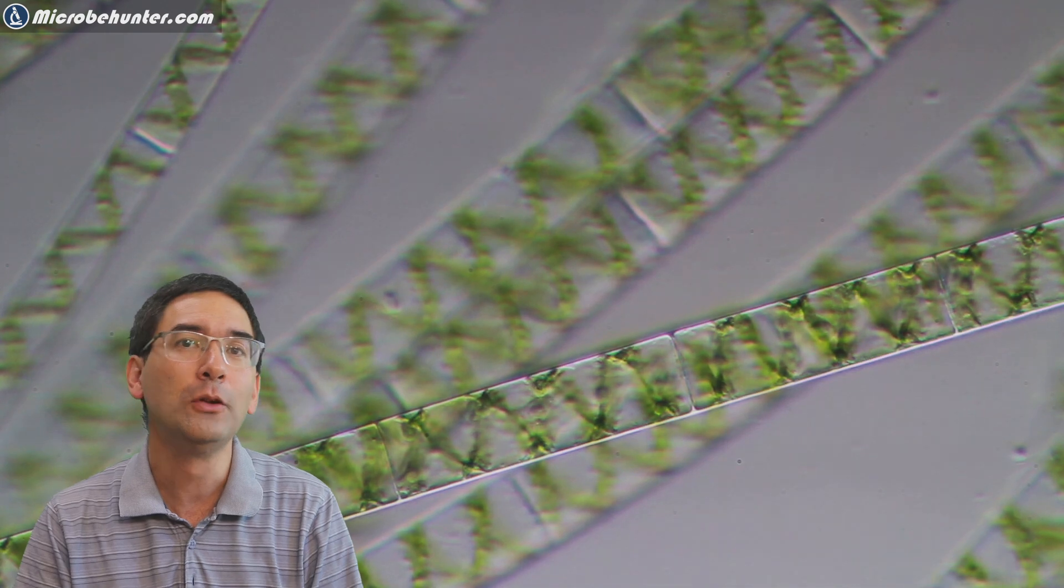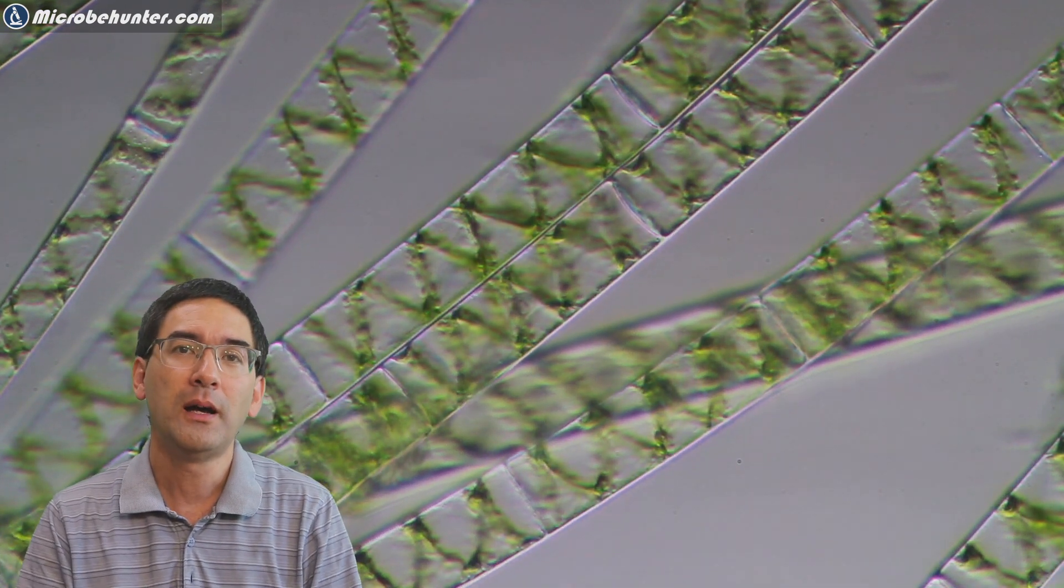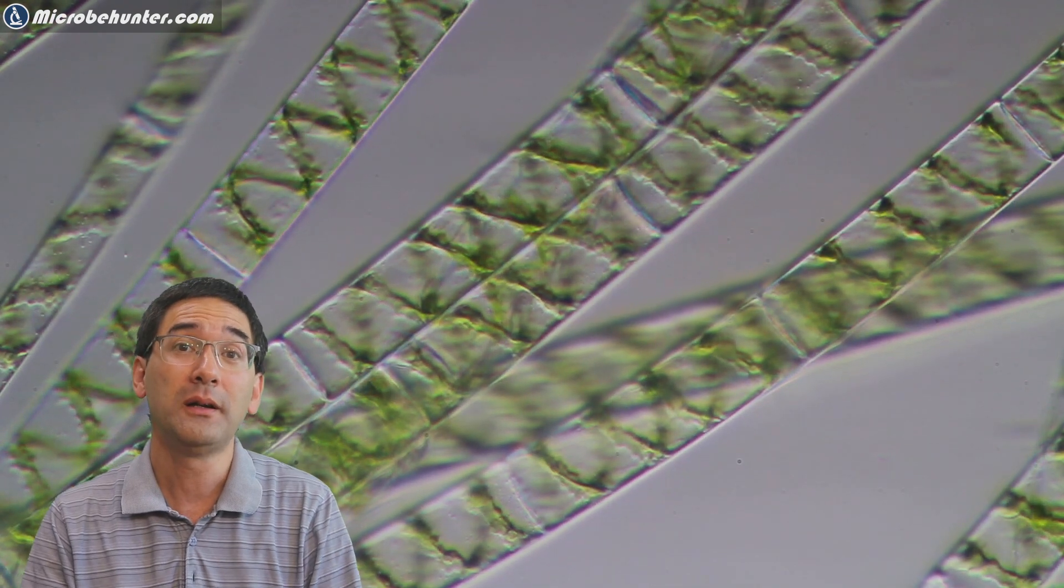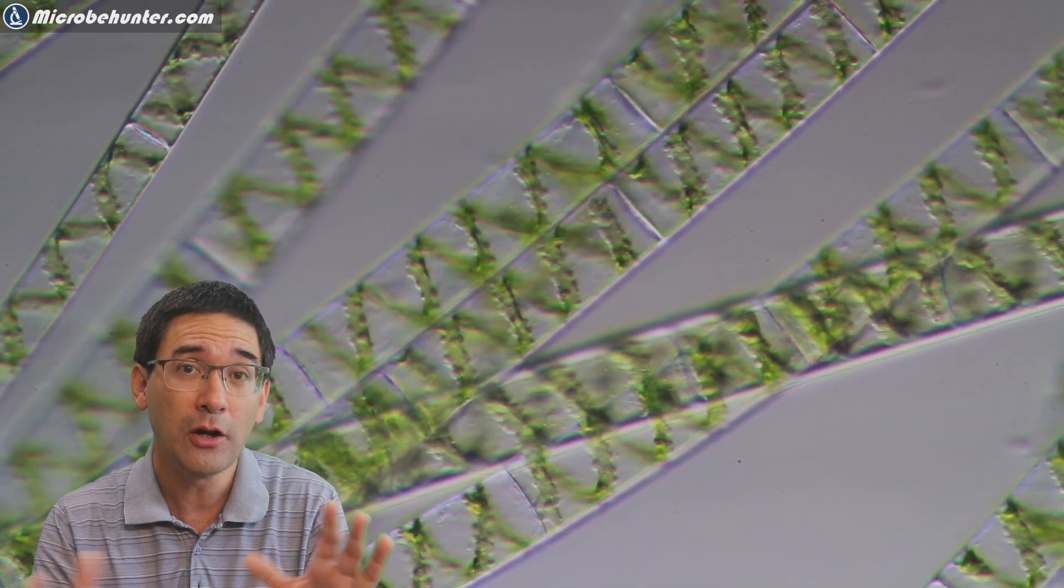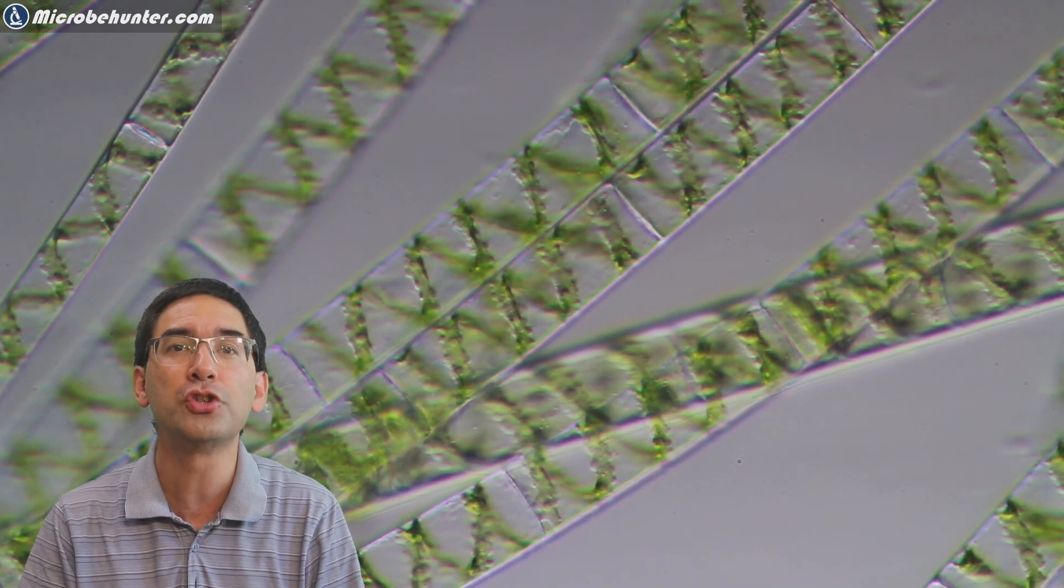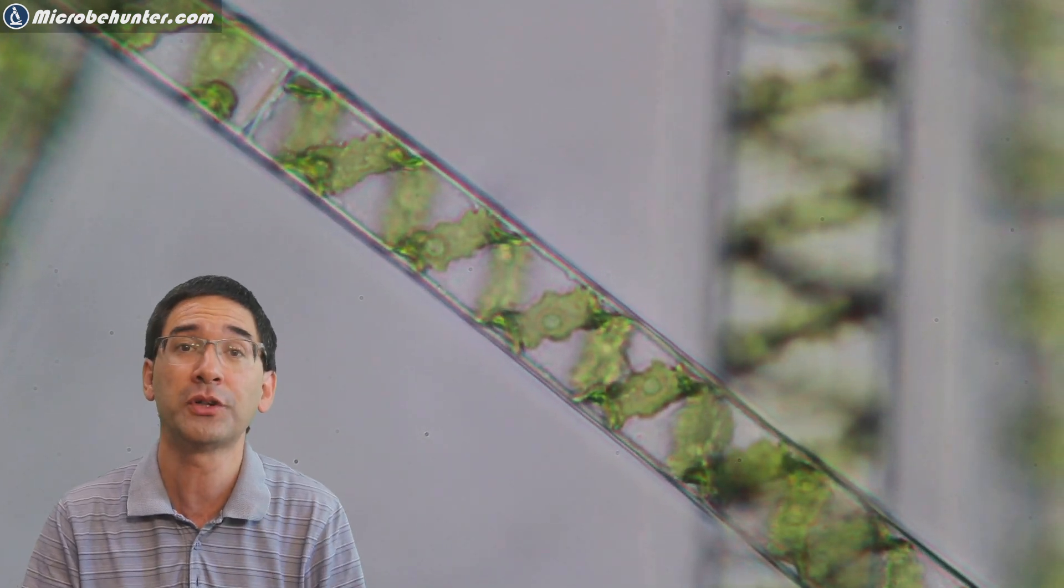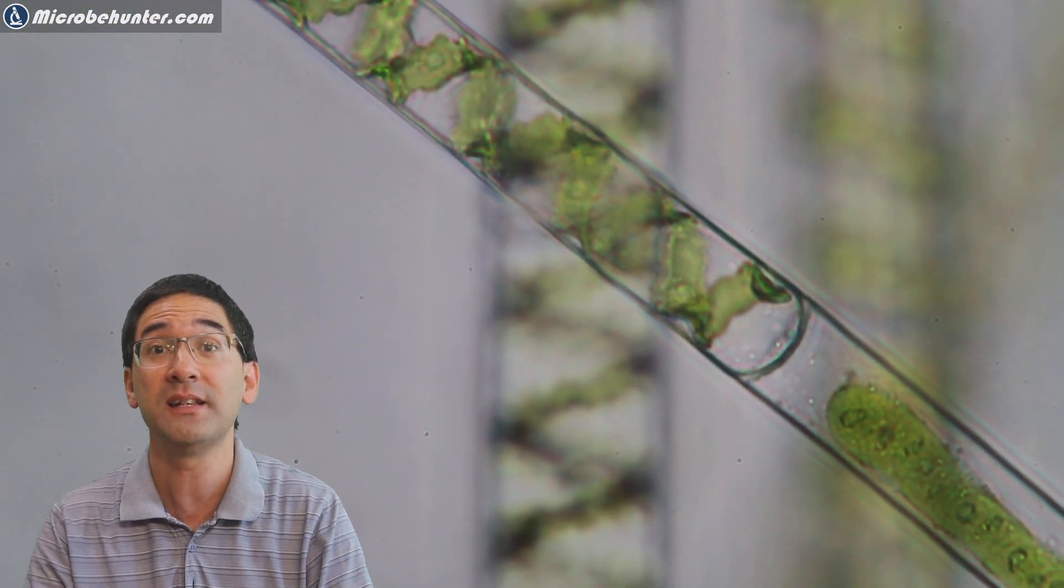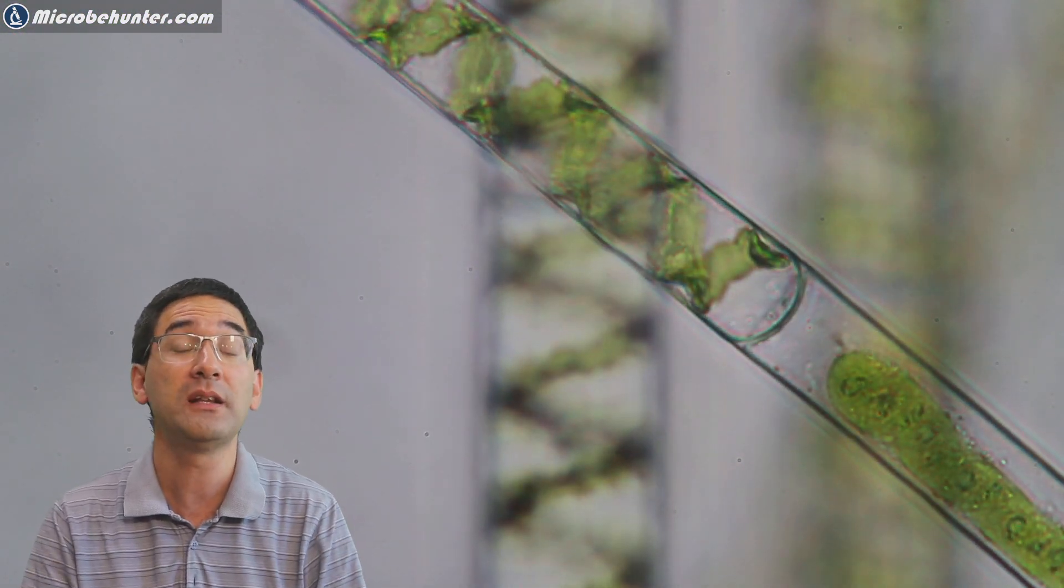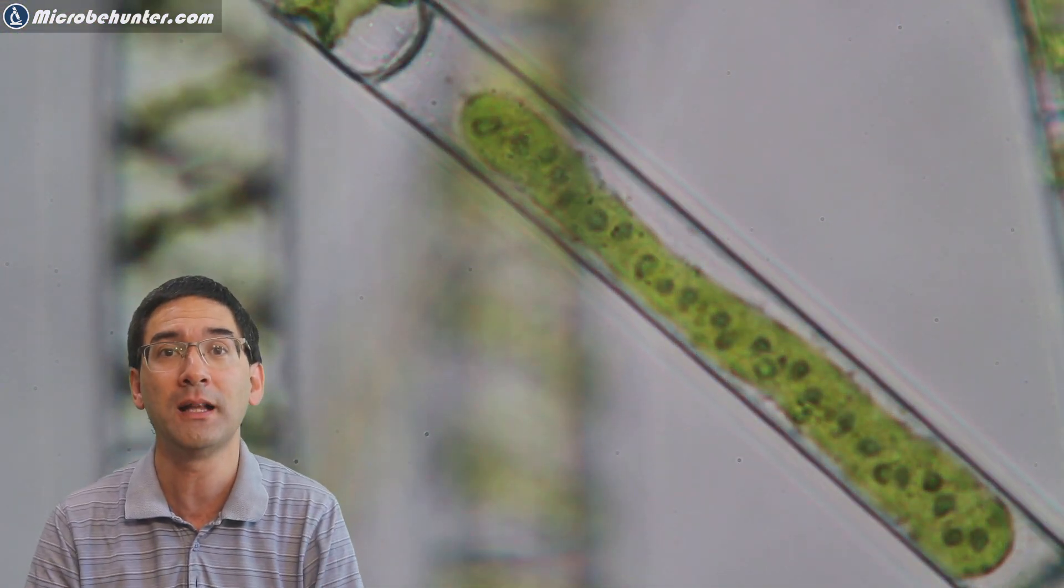This is now an oblique illumination this gives you slightly a three-dimensional effect. Now I read somewhere and scientists are not quite sure yet how many percent but I read somewhere that at least 50 percent of the world's oxygen is produced by algae in the oceans. Of course this is fresh water but this also contributes to the global oxygen production and some scientists assume that it even goes up to 70 to 80 percent of the world's oxygen being produced by algae.